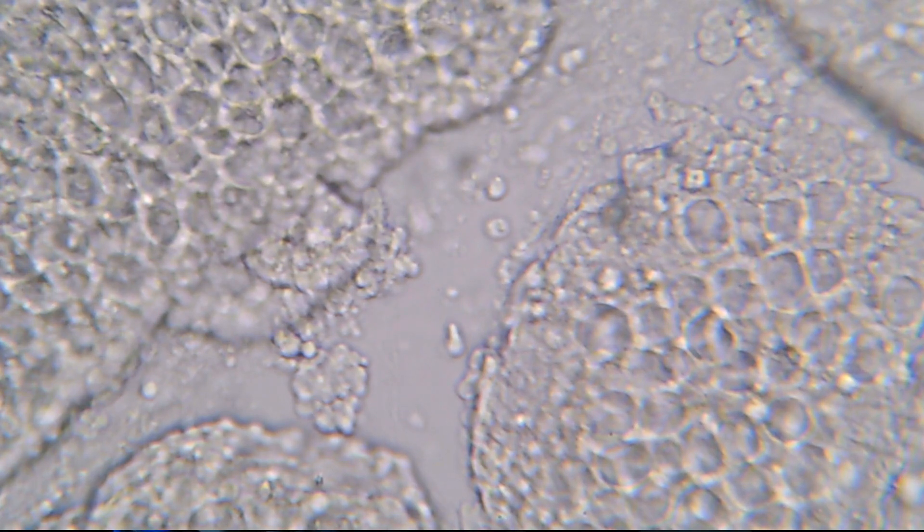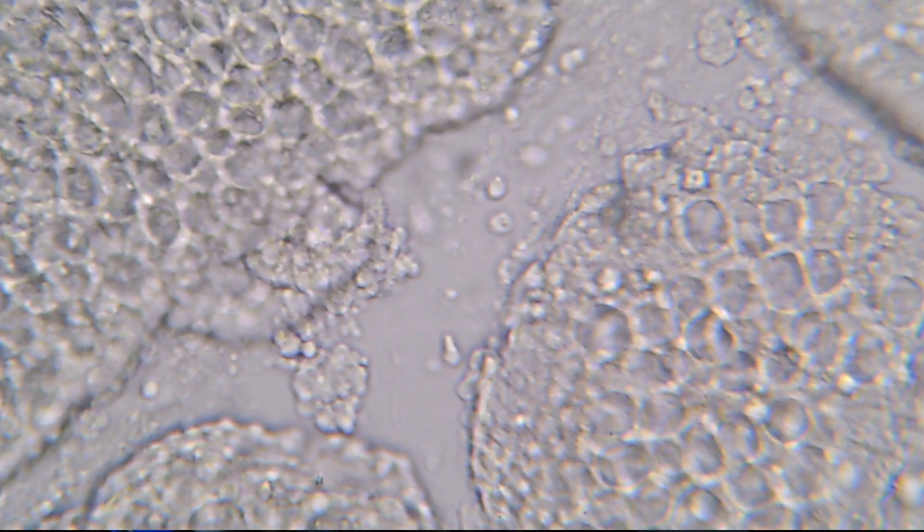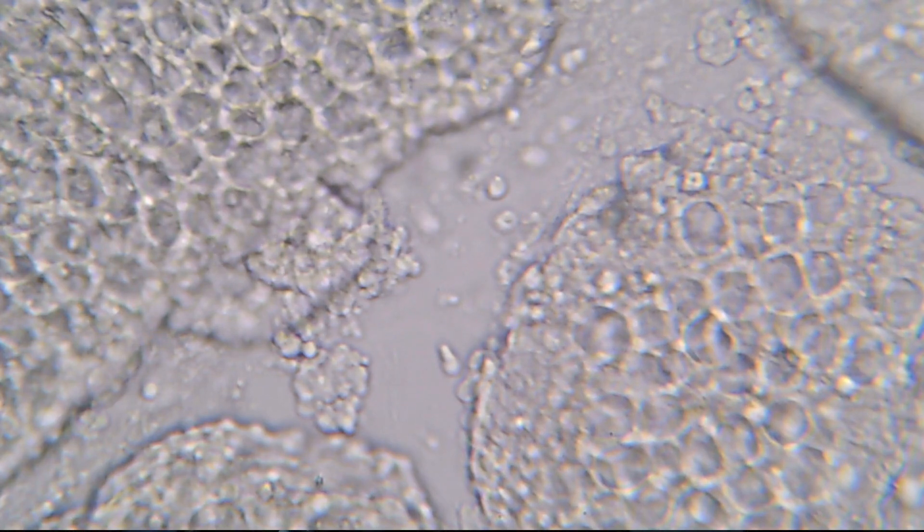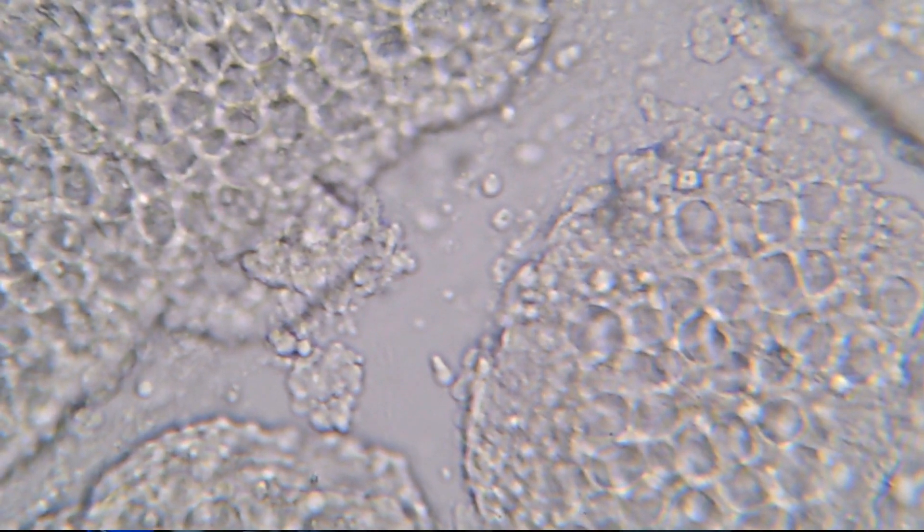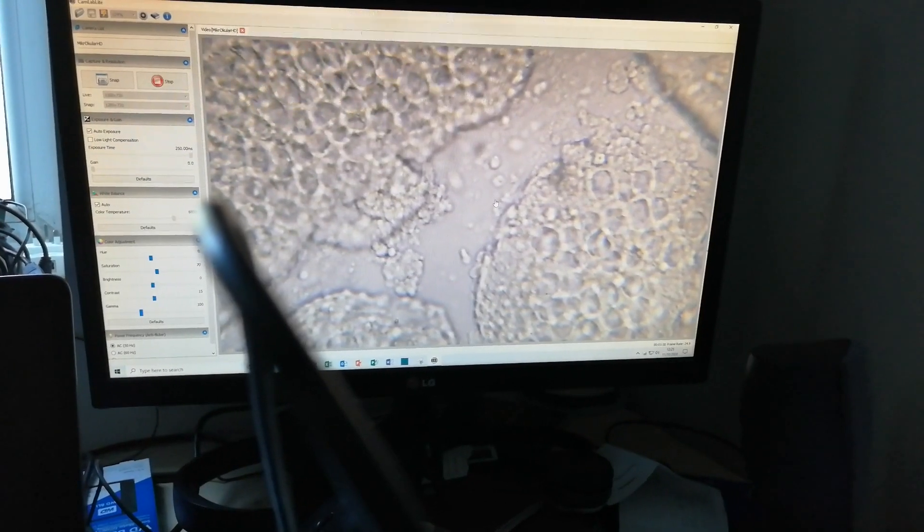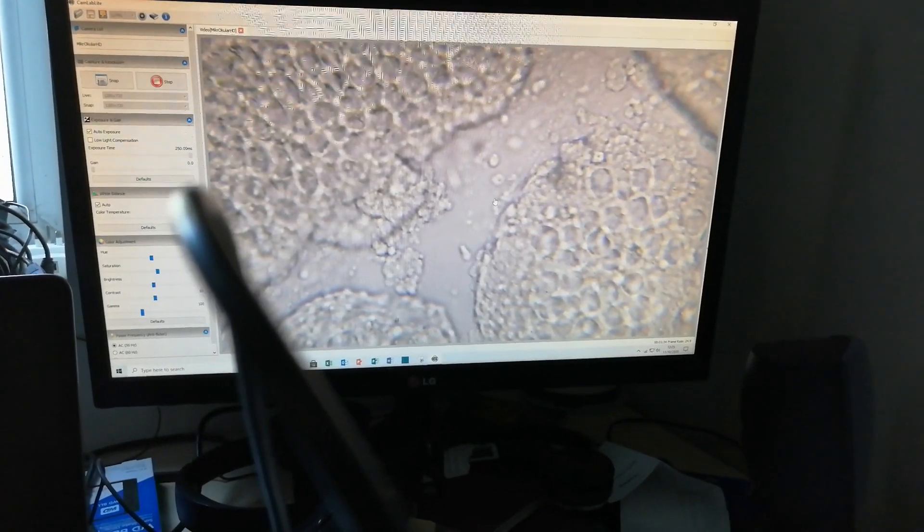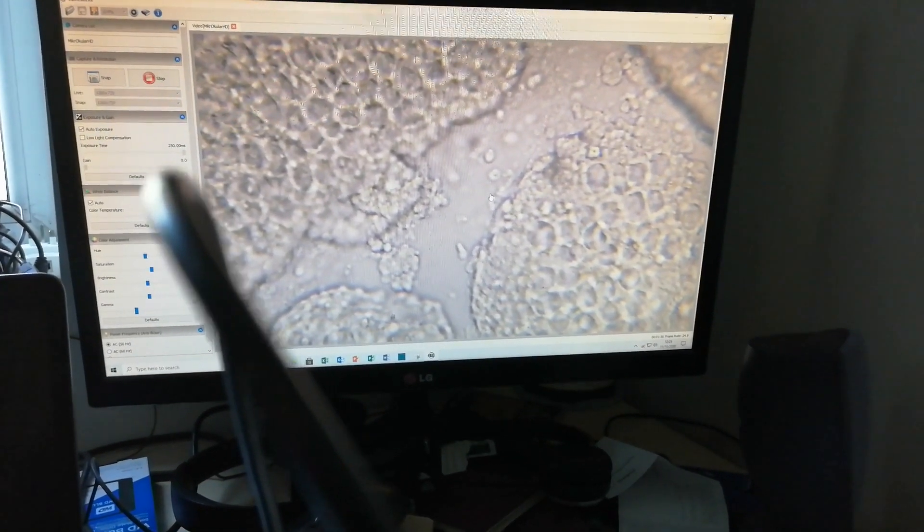You do need to be conscious that it is in a cell with a bright light done, so there's going to be warmth, things moving, compression of the slides. So things will move, but it's really things that move against the flow, across the flow, twirl.